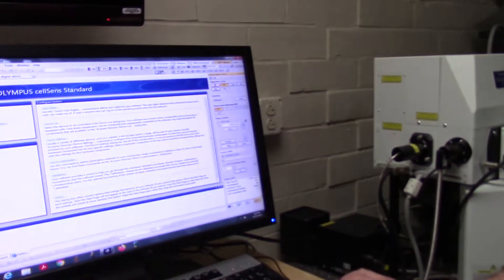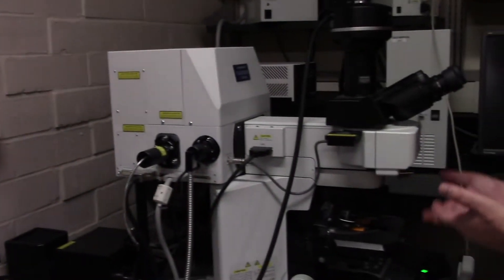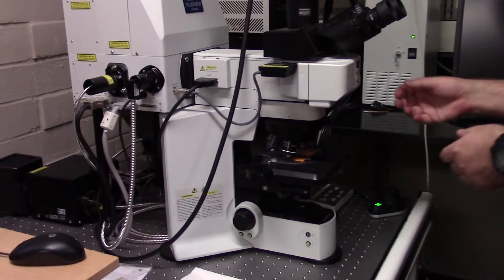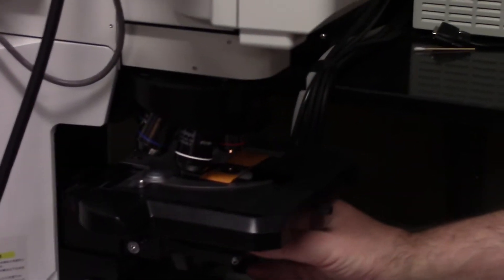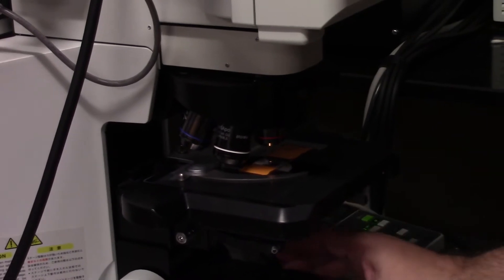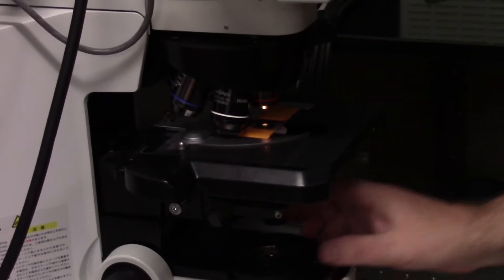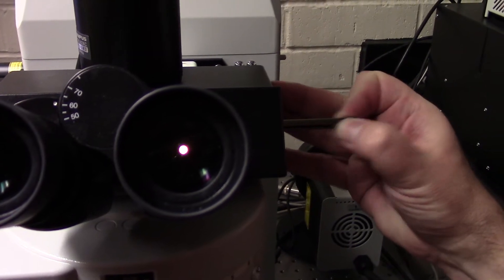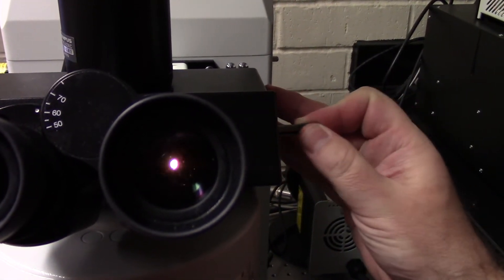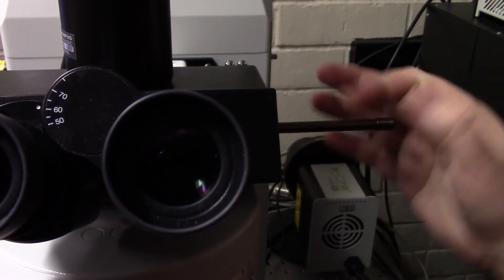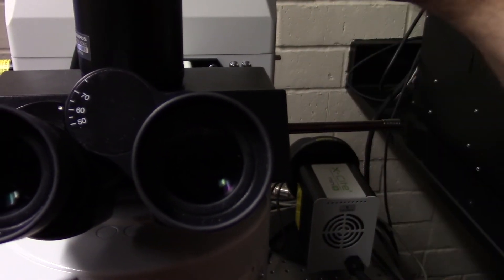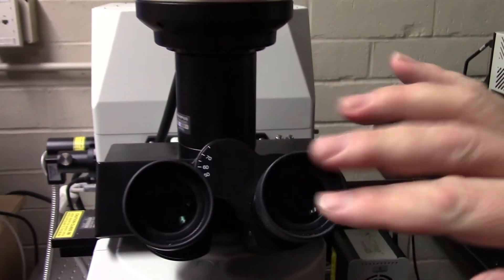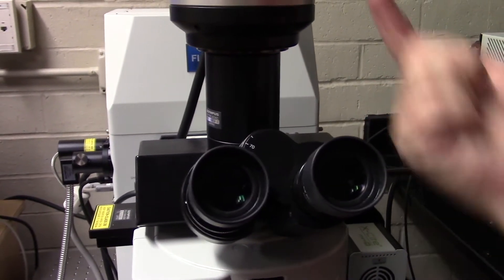I'm going to go back to 4x and see what we can see, since there's light coming up. I'm going to open the iris diaphragm so that we get a lot of light going in. This knob I can gently pull out — all the way out it has three settings: in, medium, and out. When it is all the way out, all the light comes up to the DP-71 camera. So now if I look in the oculars, I won't see anything, because all the light is going up to the camera.